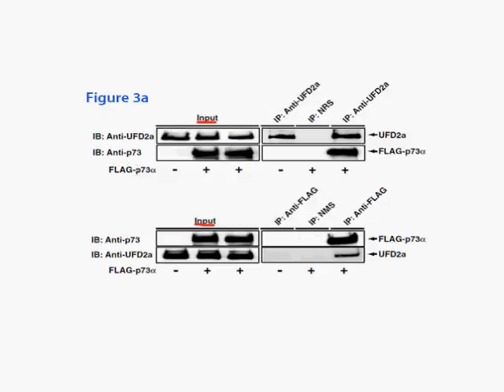However, P73A does not exist unless it is introduced by a plasmid. So when an empty plasmid is introduced, such as in the case here, no bands are seen. However, over here, bands are observed when the plasmid is present.